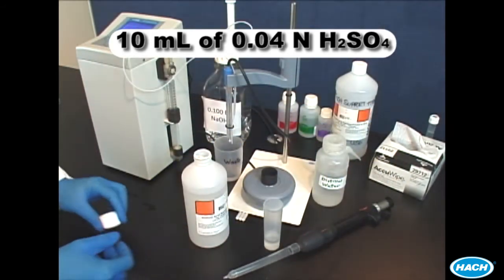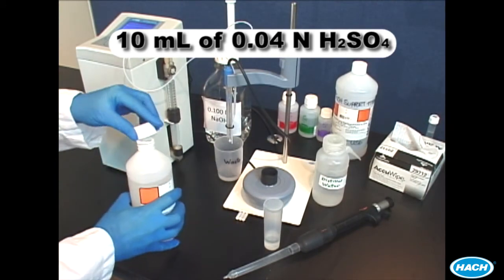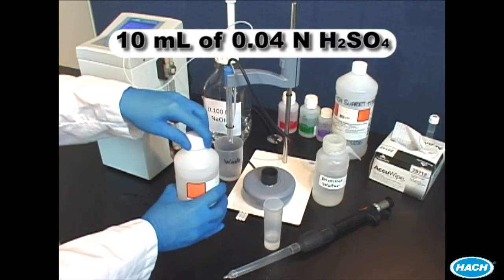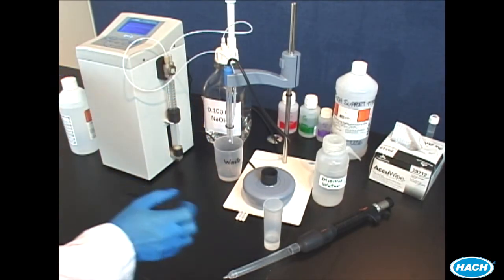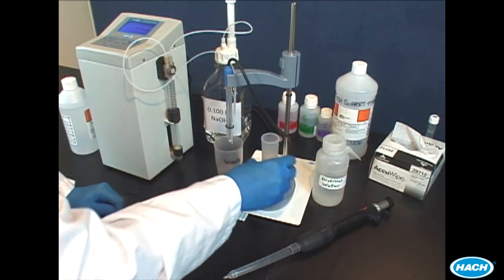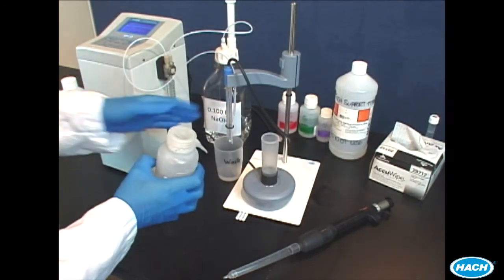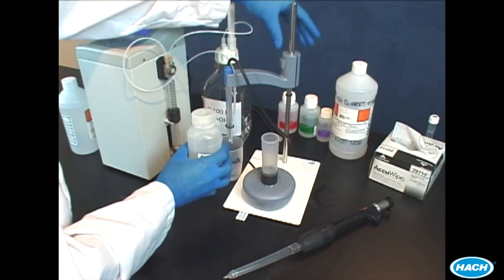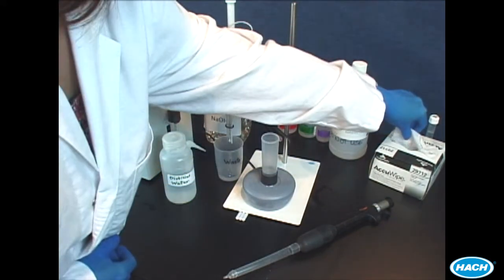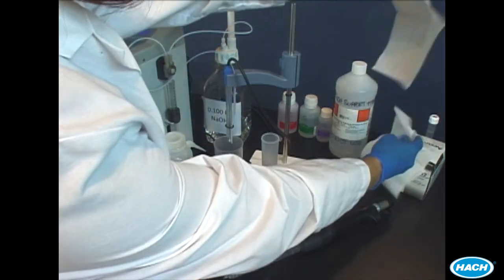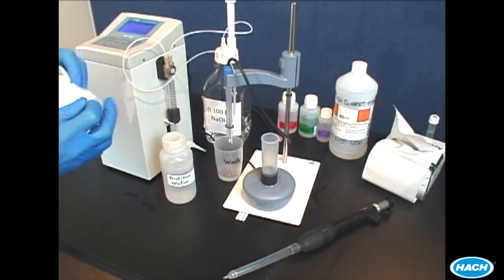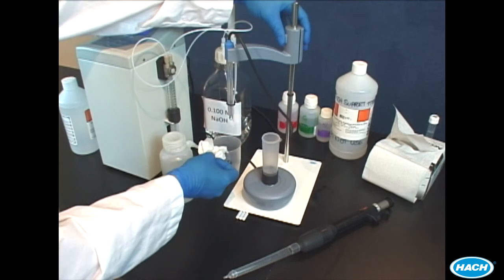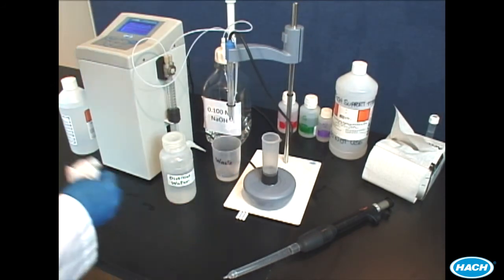Add 10 mL of 0.04 normal sulfuric acid standard to the titration cell and place the cell in the stir stand. Rinse the pH electrode with clean water. Add a stir bar to the titration cell.